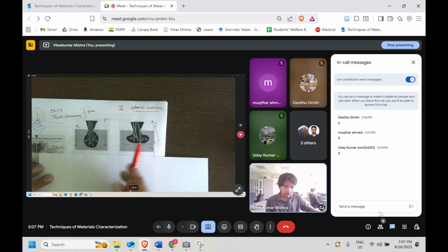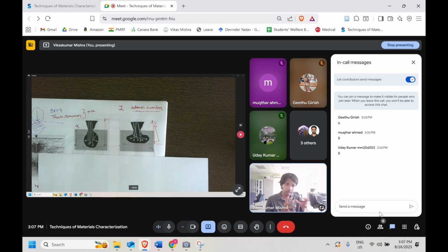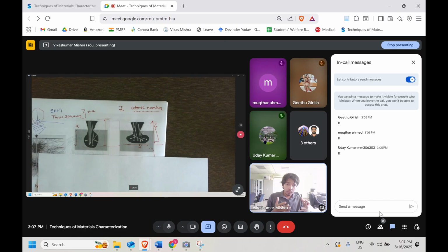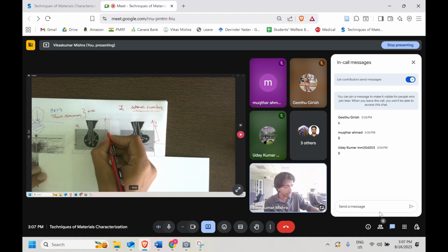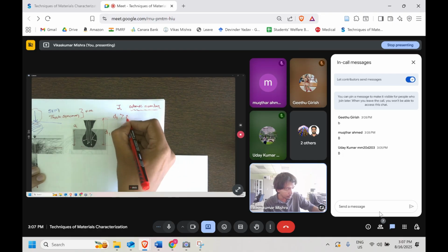we are not talking about the depth right now. We are talking about the entire volume. So what is happening is that the more the Z, the material will try to interact more and more. So initially only they will consume the entire energy of the electron beam, and they will not allow it to pass more. So a higher Z atom will restrict the penetration from the depth point of view. So here the depth is more. It is D1 and D2. We know that D1 is more than D2.